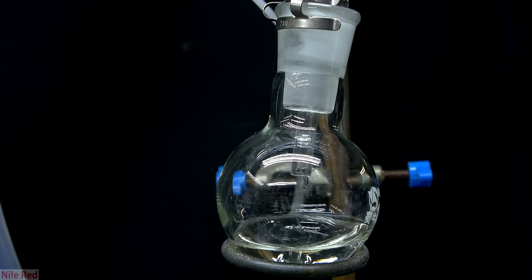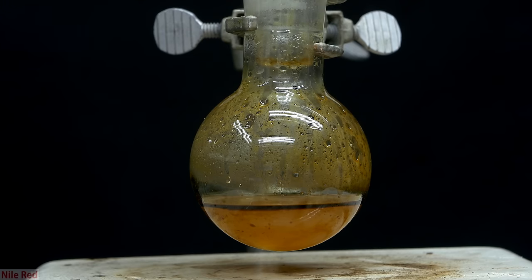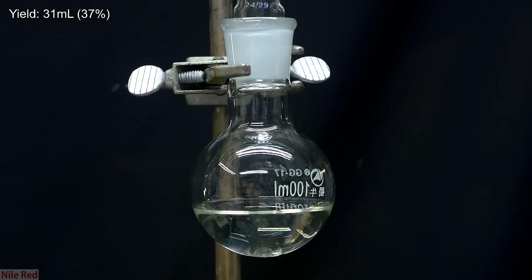At the beginning of the distillation, everything that came over was nice and colorless, but as the distillation continued and we got near the end, it took on a little bit of a yellow color. At the end of the distillation, we look at our distilling flask, we can see that it's strongly colored and there's a distinct separate dark layer above. In the end, I was left with 31 milliliters of slightly yellow and quite weird smelling acetone. I don't really plan to use this acetone for anything in particular, so I didn't continue, but if you want to use the acetone in synthesis, I would recommend distilling this at least a few more times.